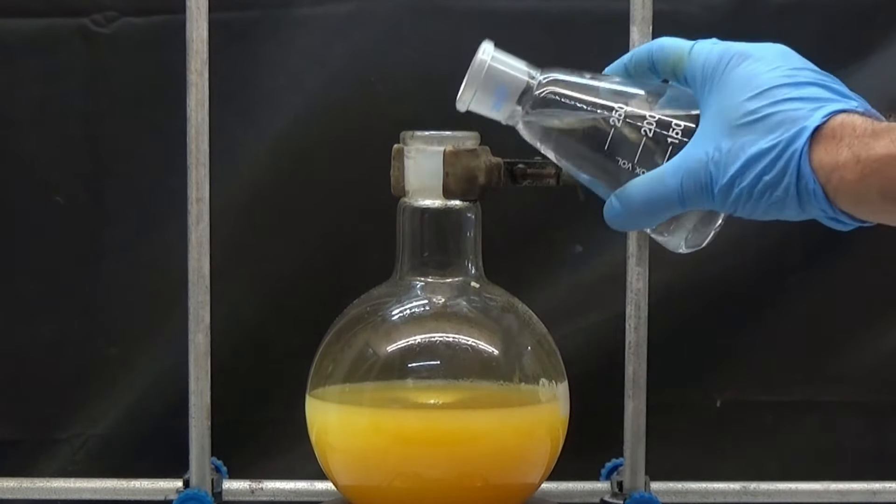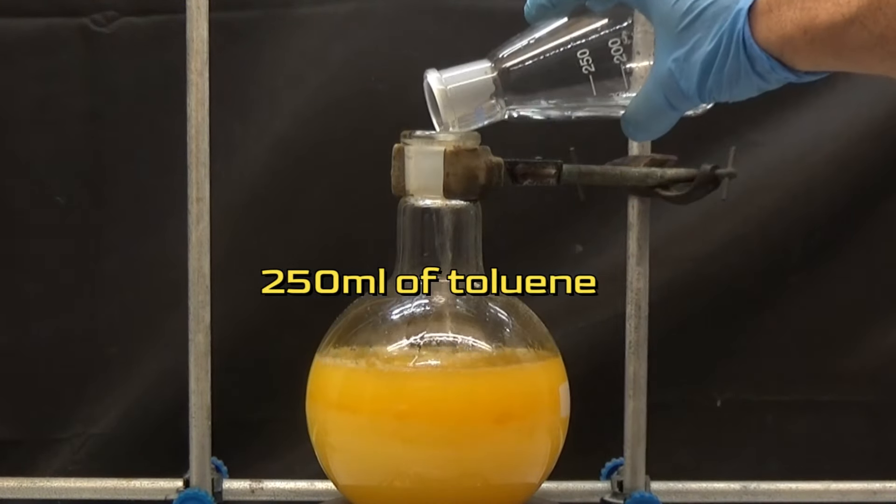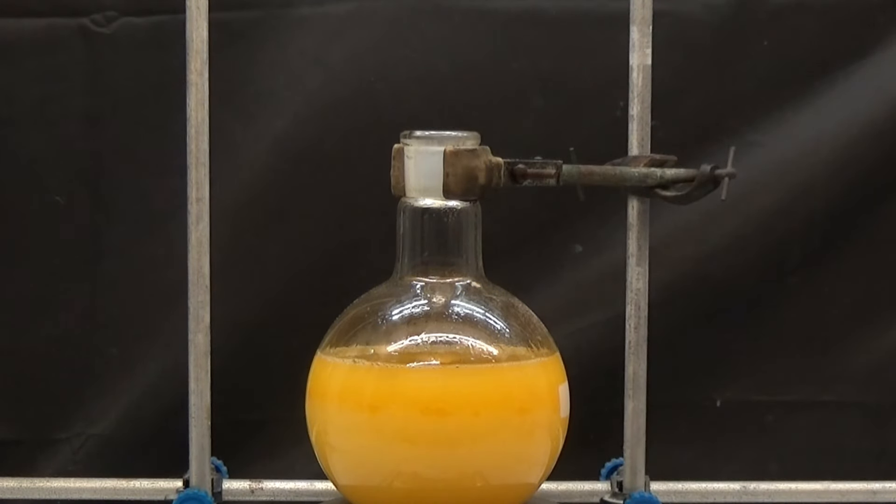To extract nitrile, add 250 milliliters of toluene. We let it stir for 20 minutes in the 1000 milliliters flask.